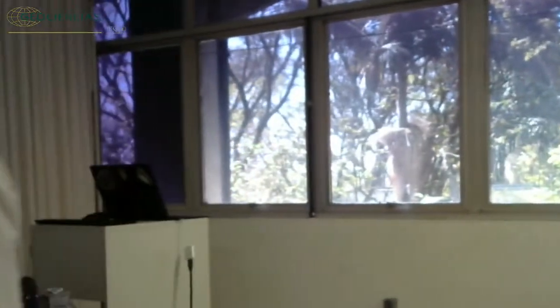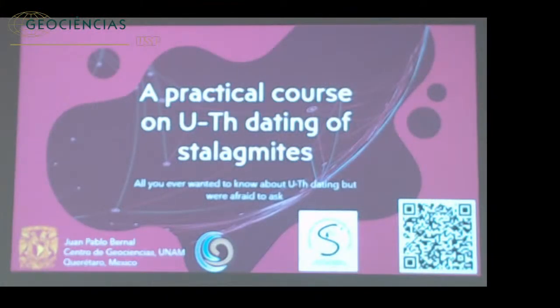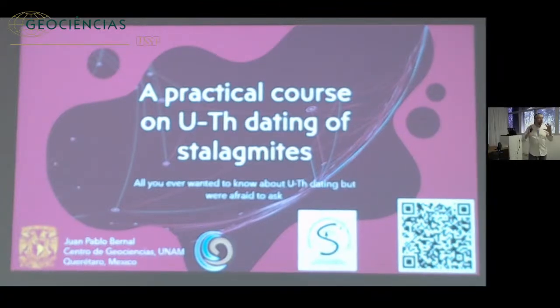This talk is a continuation of what Kathleen just discussed. She actually went ahead of me and asked for a raise of hands who has done any uranium thorium dating. Not many of you have, but now you have the basic principles of the dating, and now we're going to get more into how you obtain your data and how you work with your data in a more practical sense.